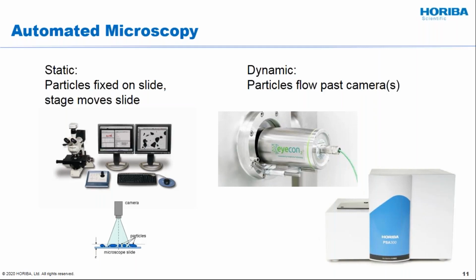You can cover a broad range of sizes. Typically, your standard light microscope might be half a micron and up. And you can go down to things like SEM, where now you're going well down into the nanometer range in terms of the sizes. And so, again, if you measure some data and you say, geez, I just got 10 microns, does that seem reasonable? Certainly what you would do is resort to some kind of microscopic image of your particles. So again, it's very popular.